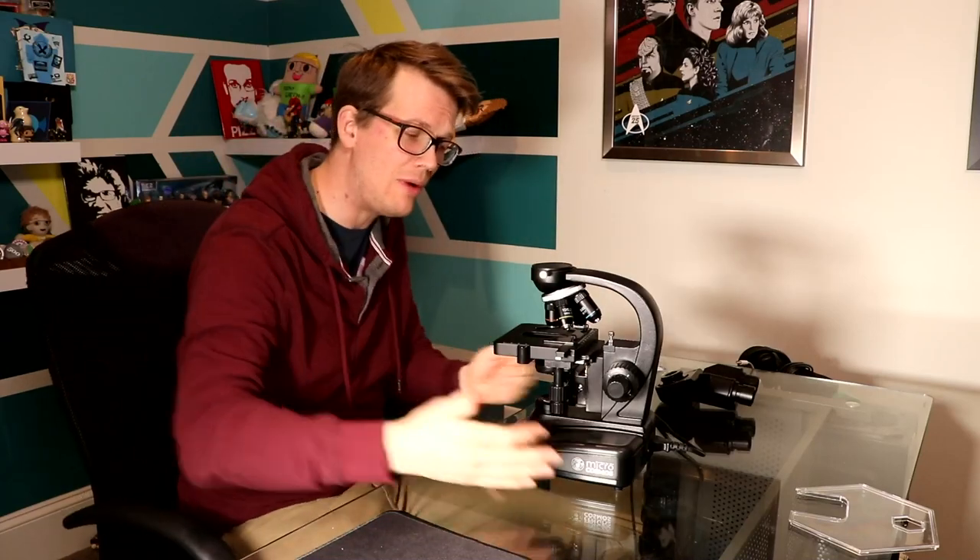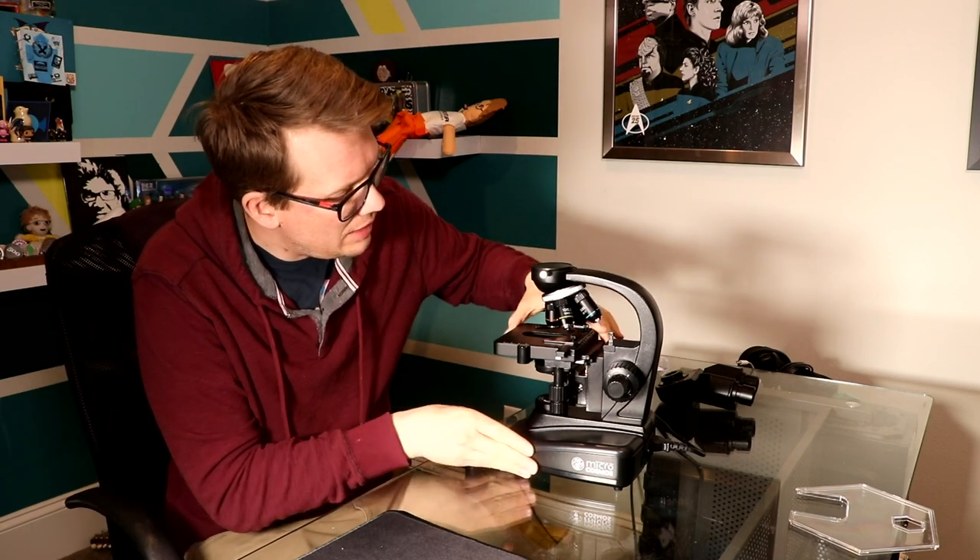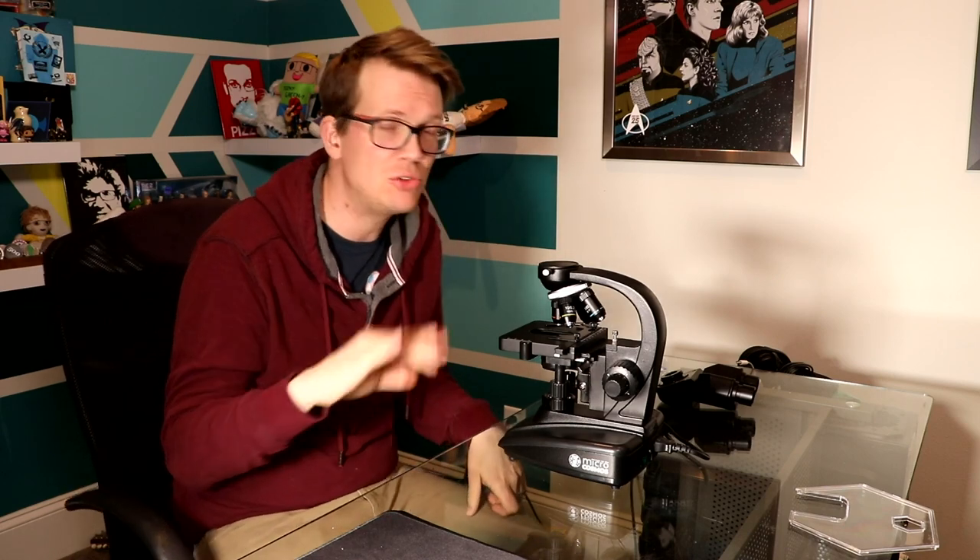Hello, it's Hank. I wanted to tell you a little bit more about the Journey to the Microcosmos microscope, which is right here. We're having a Kickstarter for it right now. And so it will arrive, and I'm going to talk to you a little bit about the parts of it that you will need to know about when you are first taking it out of the box. This will be the first in a series of instructional videos.